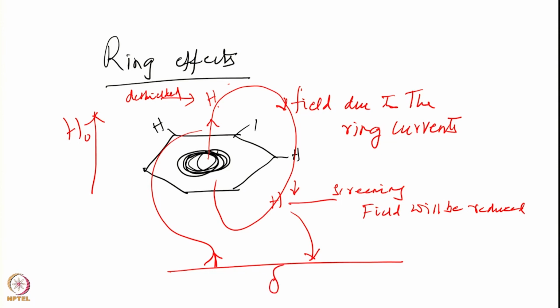So, in a molecular structure you will have various kinds of protons coming in and around the aromatic rings. So, what is the effect of the aromatic ring on the neighboring protons? How does it change the spectrum? That is the effect which is reflected in this parameter. There are various places where one can see these ranges of chemical shifts, there are tables. I will possibly show these tables of the chemical shifts for the different molecules in the next class. I will have a slide to show you the ranges of the chemical shifts for different kinds of protons. Okay.